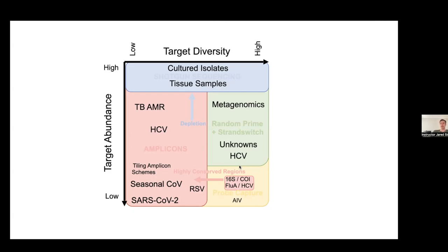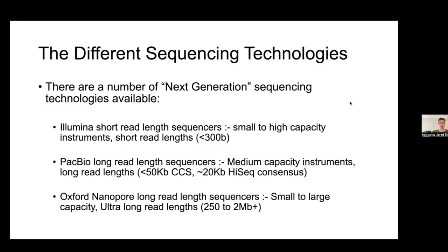so that they don't influence the analysis of the viral genome. So this problem of high host contamination is something we handle on the informatics end. And then the second part of your question, whether we have a reliable genome construction, is something I'm going to cover in depth later on in this lecture. So I'll defer that question a little bit, but it's certainly a very important one. All right, so let's carry on now. Great questions, everybody. I think that was a great discussion.